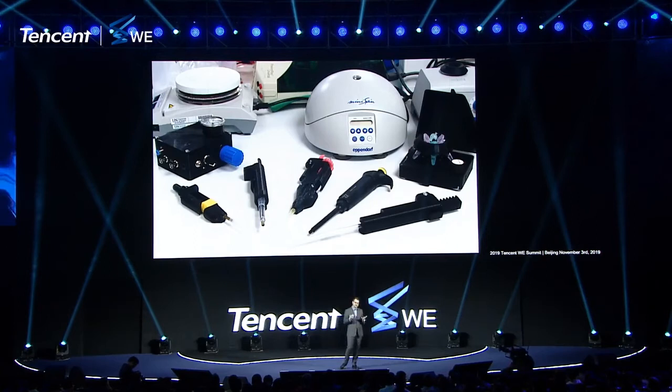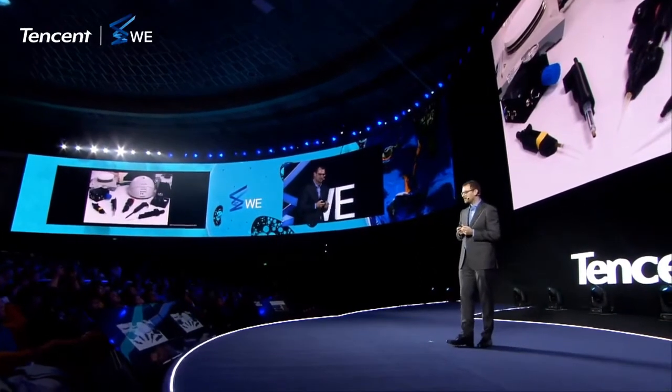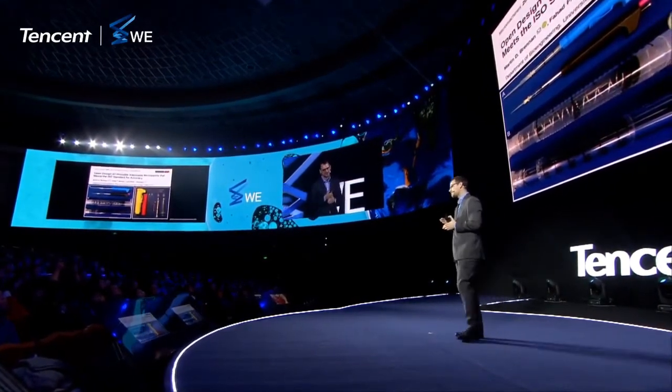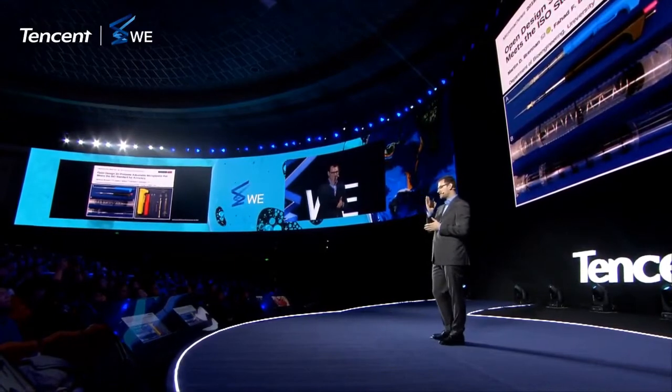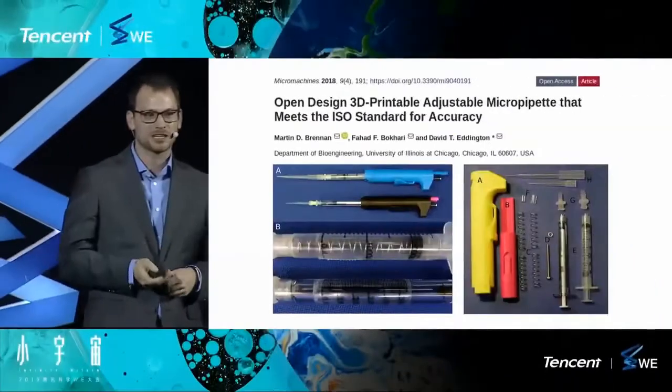So today, when you go in a search engine and you put 3D printed pipette, you will find lots of different versions, lots of different quality grades. Here's a few of them displayed. We come to a point when it's not even that easy anymore to tell apart which one is the commercial one. It's the second from the right in this case. And actually, some of these pipettes are now meeting ISO standards for accuracy. So this is critical. This is the standard that you would need if you wanted to commercialize this pipette. You could sell this, and it would fly, right? Similarly, you can say, I did my experiment using these pipettes, and then people wouldn't really have grounds to complain that you used subpar equipment, right? So some of these tools are really coming along, and they're becoming very powerful.